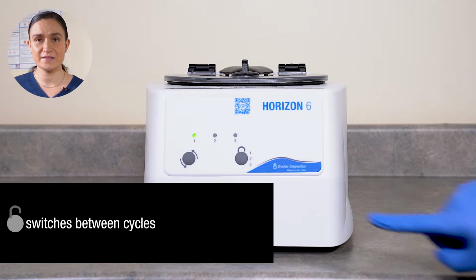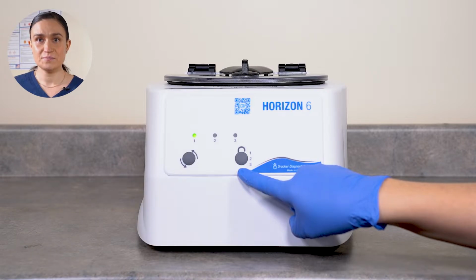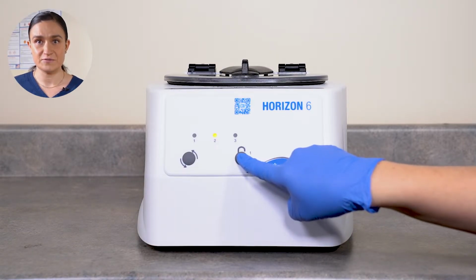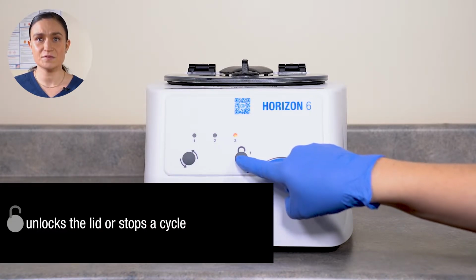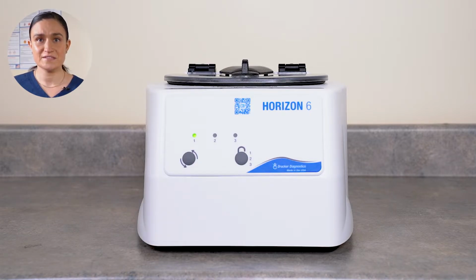Pressing the Stop Unlock button will allow you to switch between cycles. You may need to press Stop Unlock once before it starts shifting between cycles. That's because the Stop Unlock button also unlocks your centrifuge, and cycles can only be selected when the centrifuge is unlocked.